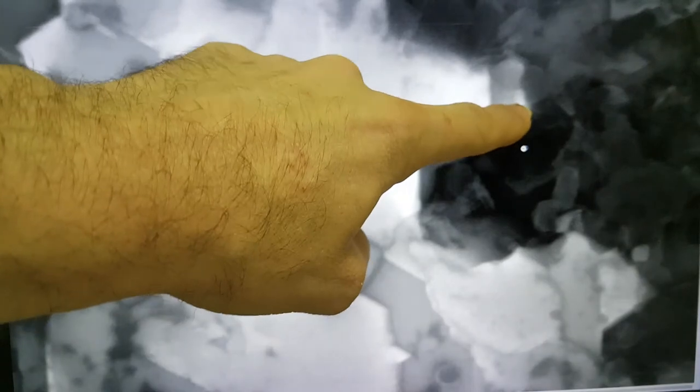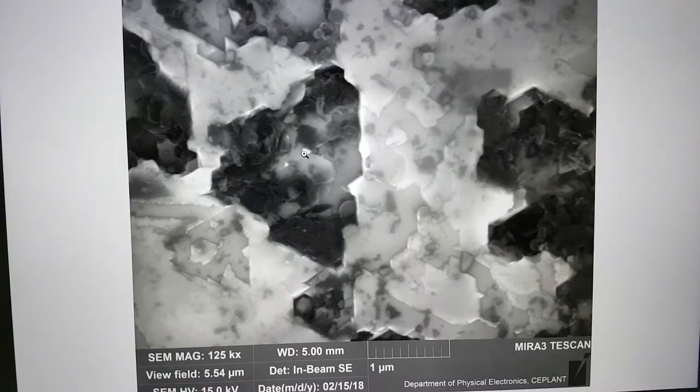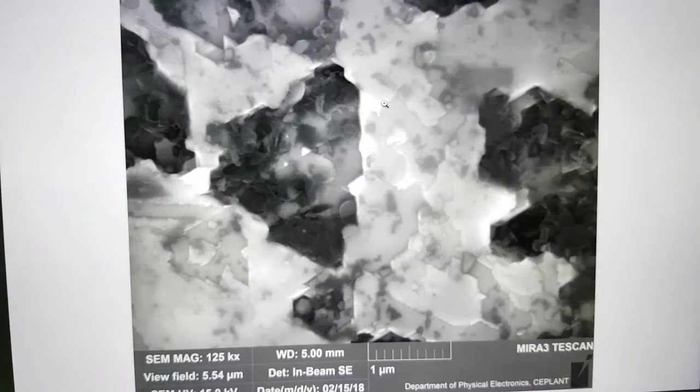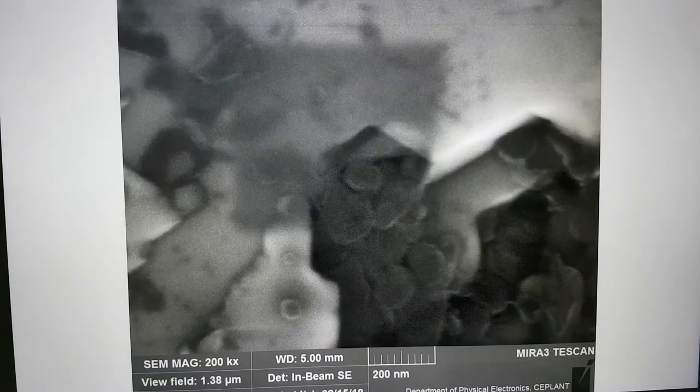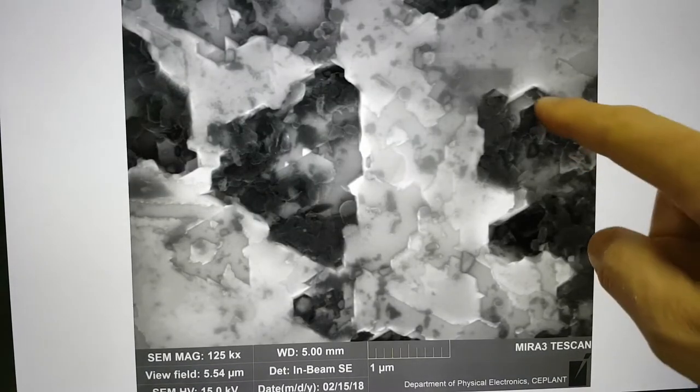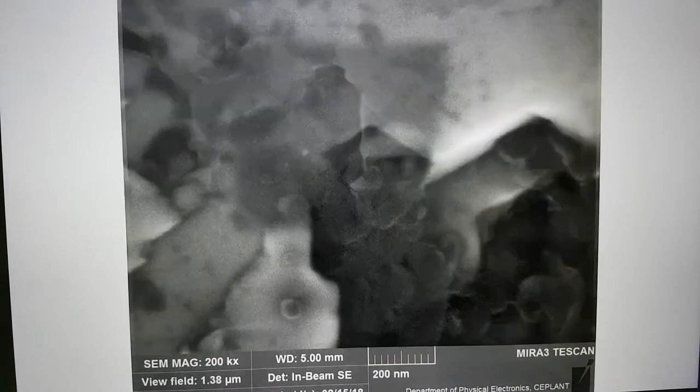Or as some things have done, they're kind of burrowing down into the material. You've got a sphere here and it's burrowed into the material down this way. This is absolutely fascinating to me, it's a complete departure from the even oxidation that's going on. What does it all mean? Let's have a closer look.